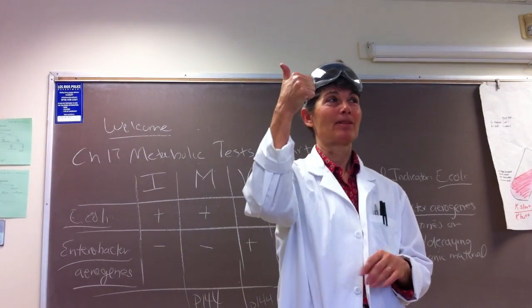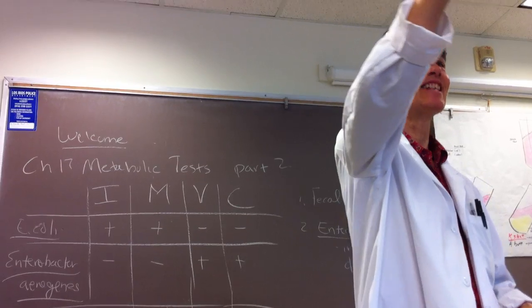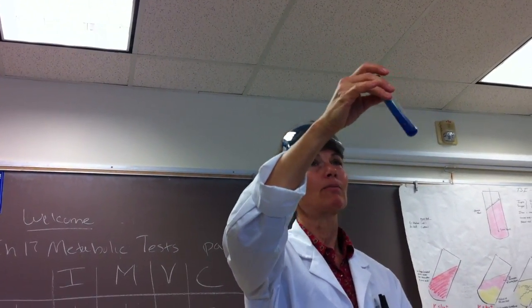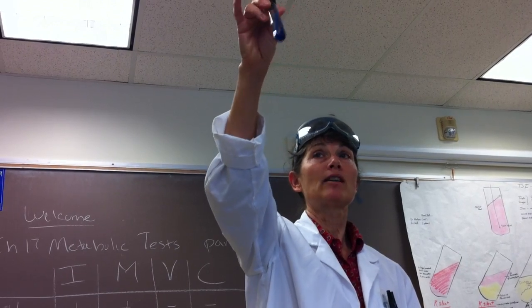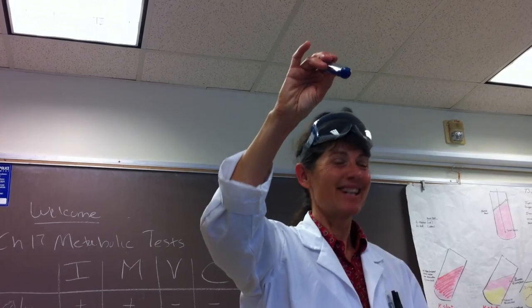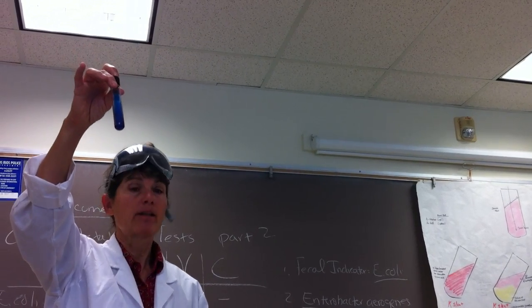The pH goes up, right? What color is bromothymol blue at alkaline pH? Blue. Oh, that's so beautiful, you guys. This is like my favorite test. Isn't that gorgeous? That's sometimes described as Prussian blue, or some folks say Levi jeans blue, but that's a positive citrate test. Okay. So we get an alkaline reaction, and bromothymol blue turns blue. Okay, so that's lovely. Would we predict this would be E. coli or Enterobacter? Enterobacter. Enterobacter, that's right.